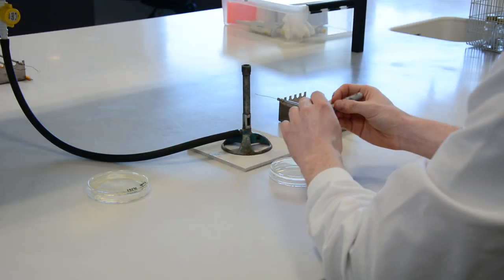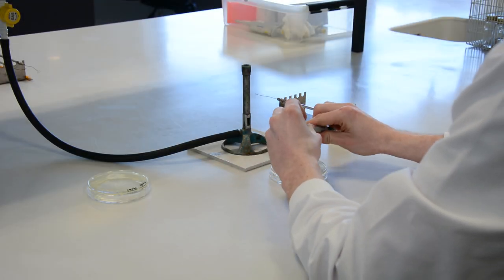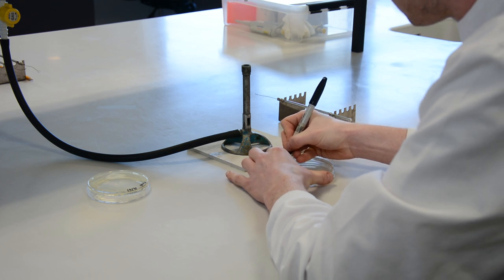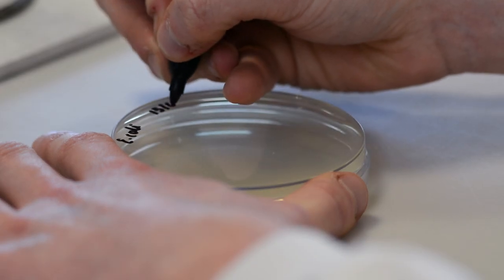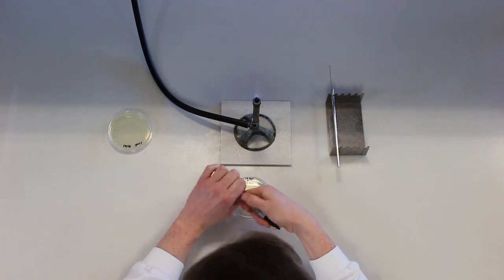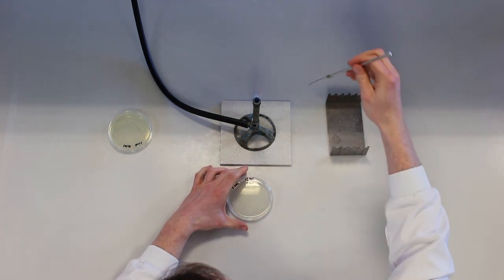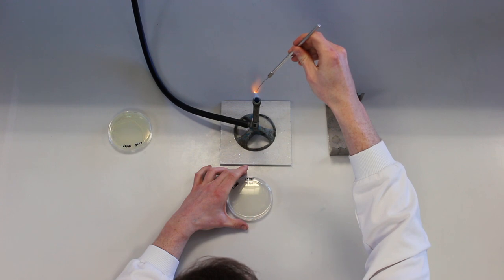First, you label your equipment with the date, the name or source of the microorganism, your name, and your group or class identifier if appropriate. These are written around the edge of the base of the plate containing the agar so as not to obscure the growth on the plate. We write on the base so that if the lid of the plate is lost, the culture can still be identified.